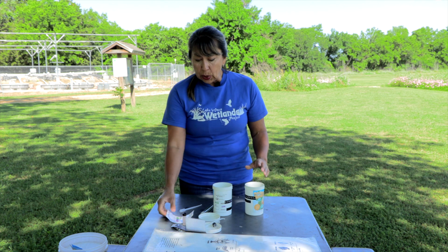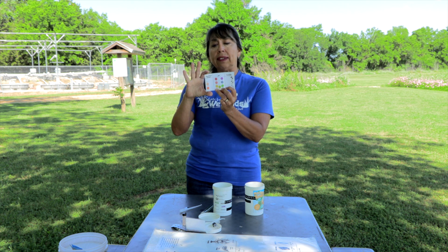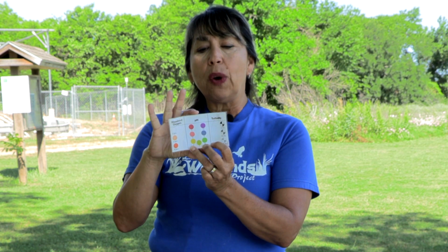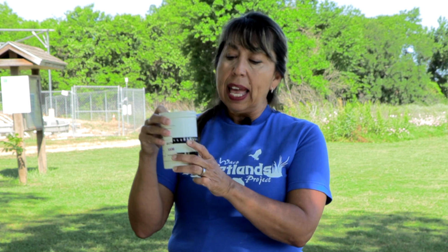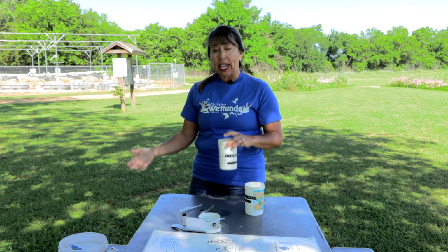So first, we're going to go over the parts of the test kit. This is the answer sheet, and it's all color coded, so we're going to see what the dissolved oxygen coloring should be in a healthy system. We're going to talk about pH, and we're also going to talk about the turbidity. But first of all, I got the water sample from the Lake Waco Wetlands out here at the inflow, and as you can tell, we have a temperature gauge right in here, and the most highlighted one is 24, and that's 24 degrees Celsius. So just remember that when we're tallying the results in just a little while for saturation.